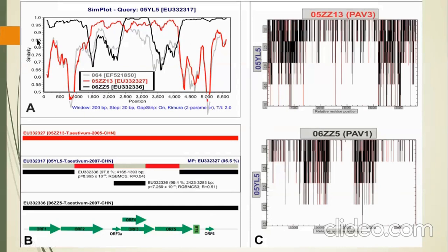So this is a graph, and this graph is important. Try to understand this graph. A value above, like if this is above, is being considered. So this means that this sequence is black. Initially, the start of the sequence is this one.